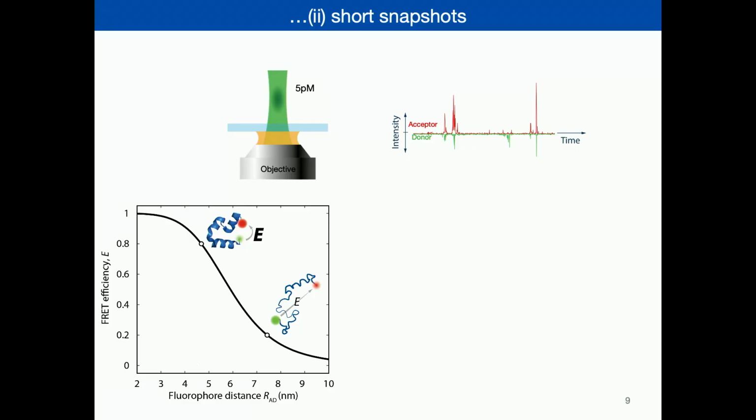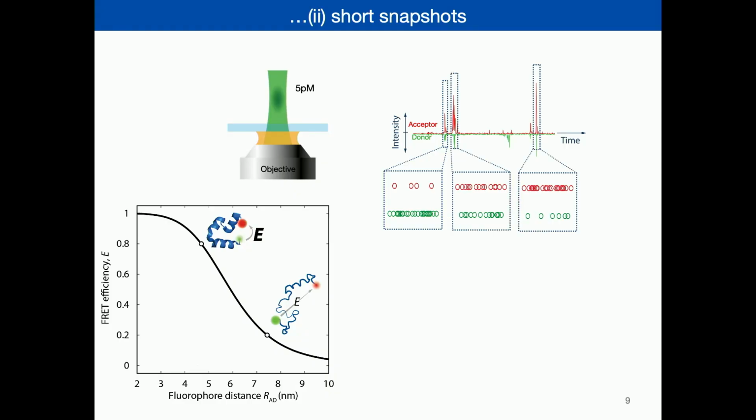Yeah. So you see that occasionally the fluorescence goes up, and this was always the case when a molecule was in your confocal volume. If you then go to one of these bursts, you can collect 4 acceptor photons, whatever tens of donor photons, or other cases, and a third case where you get more acceptor photons, for instance.